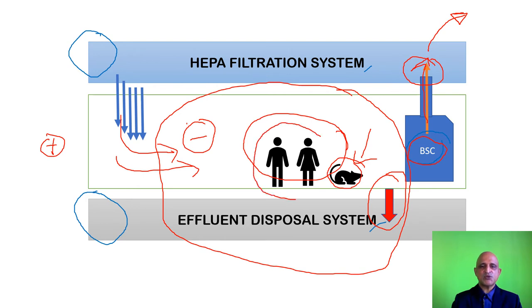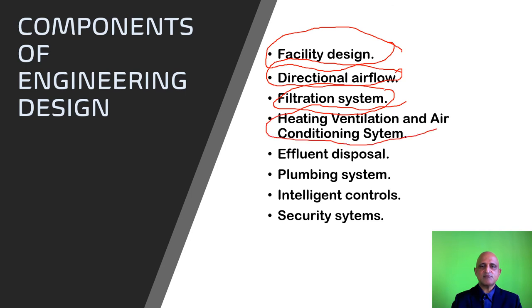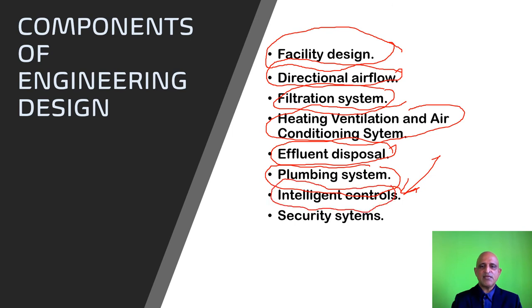Personnel must also don proper personal protective equipment to work in this facility. The engineering design is governed by the facility design itself — this is where engineers come in. Components include directional airflow, filtration systems, heating, ventilation and air conditioning (HVAC) systems, the effluent disposal system, plumbing systems, intelligent controls involving computers and devices that link your laboratory to a network and can be monitored from a remote hosting station, as well as security systems responsible for biosecurity management at the facility.